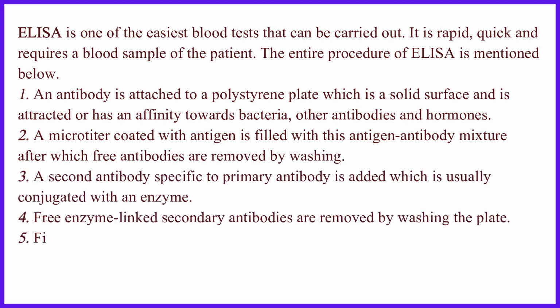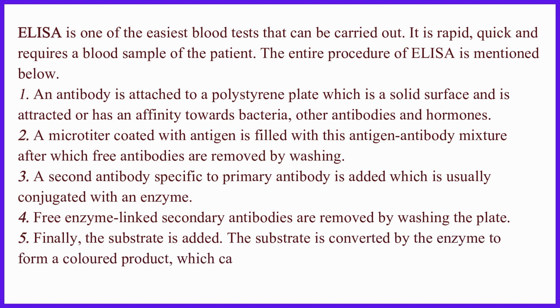An antibody is attached to a polystyrene plate, which is a solid surface and has an affinity towards bacteria, other antibodies and hormones. A microtiter well coated with antigen is filled with this antigen-antibody mixture, after which free antibodies are removed by washing.